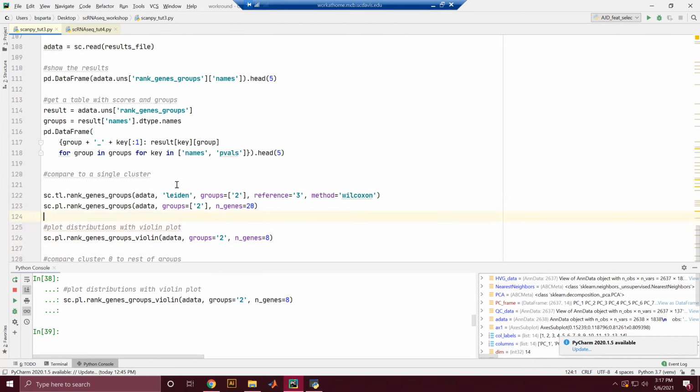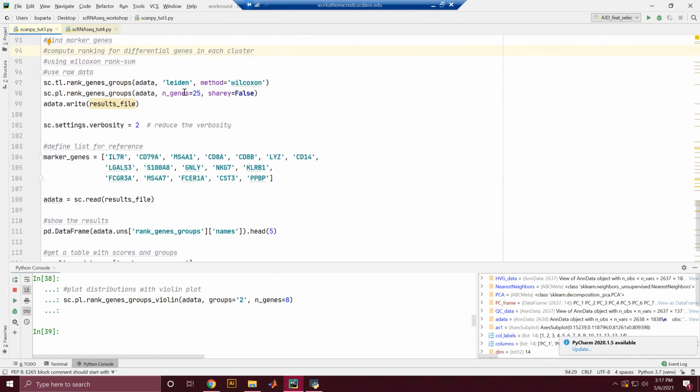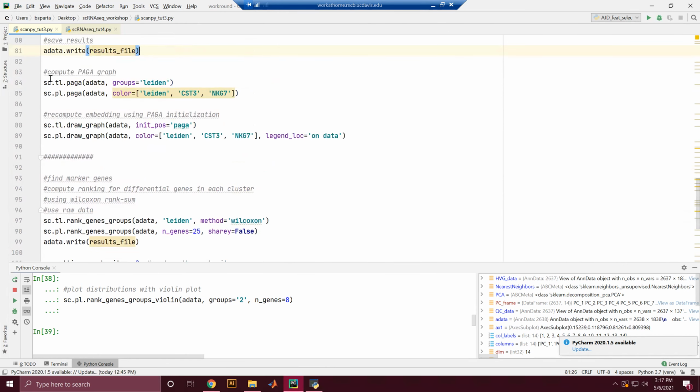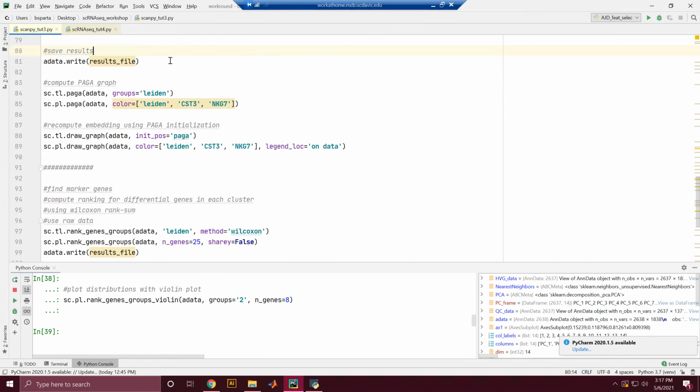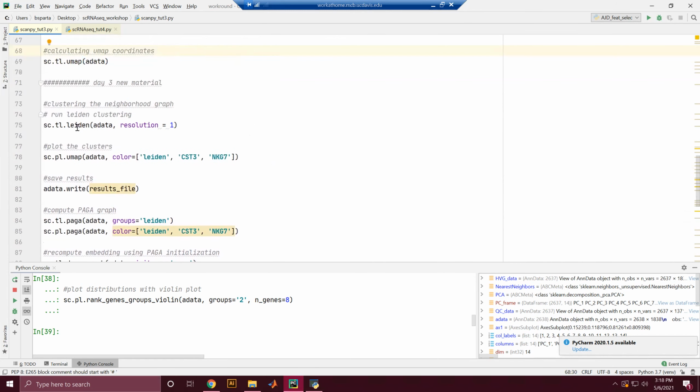Oh, so maybe that would indicate that we don't have the data matrix named Leiden. Here is where we name the groups Leiden. Actually, it's further back. The Leiden function should do that by itself, unless you missed this line. Line 74? Yeah. Huh. Okay.